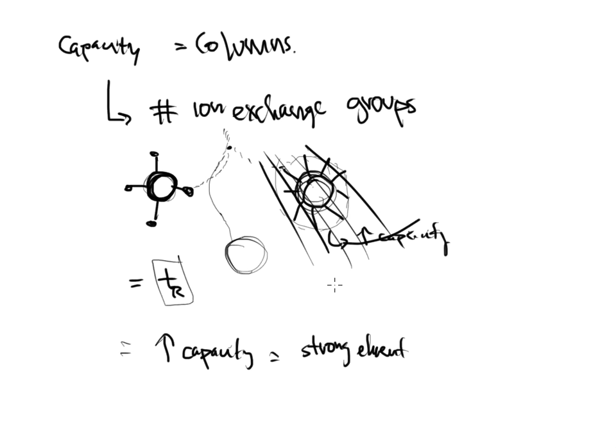And sometimes these particles get a little too comfortable and you want them to go. And the way that we do that is if we increase the eluent pH and we put a stronger concentration of eluent in our mobile phase, then we're going to have to pump that stronger solution through so we can dislodge all of those particles that are stuck to the surface.